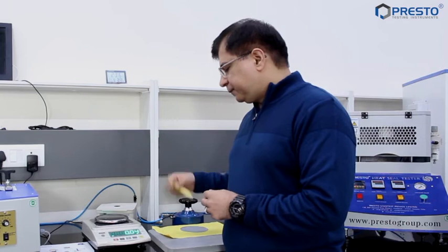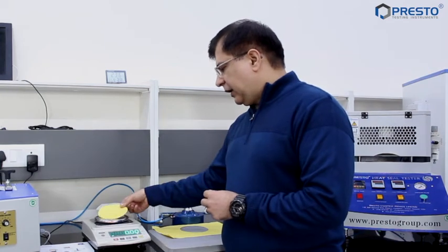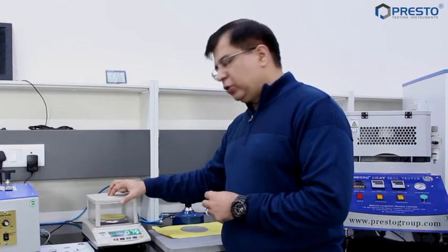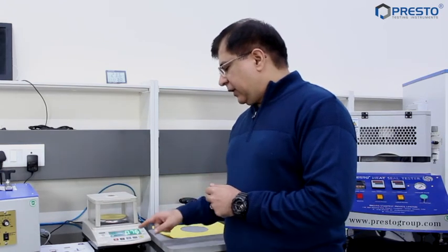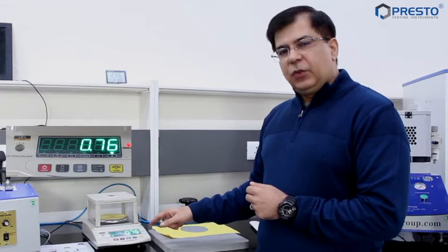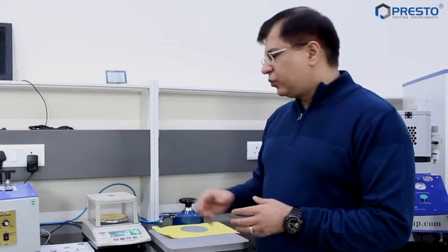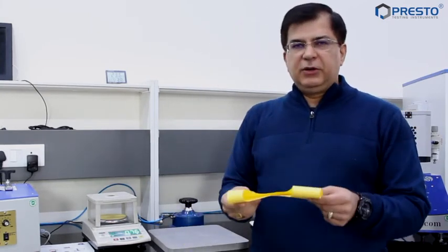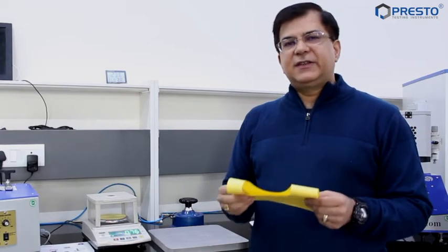Put the windshield back. Here we can see 0.76, which means that 0.76 multiplied by 100 is the GSM, which comes to 76 GSM. So this paper which you see in my hands is 76 GSM.